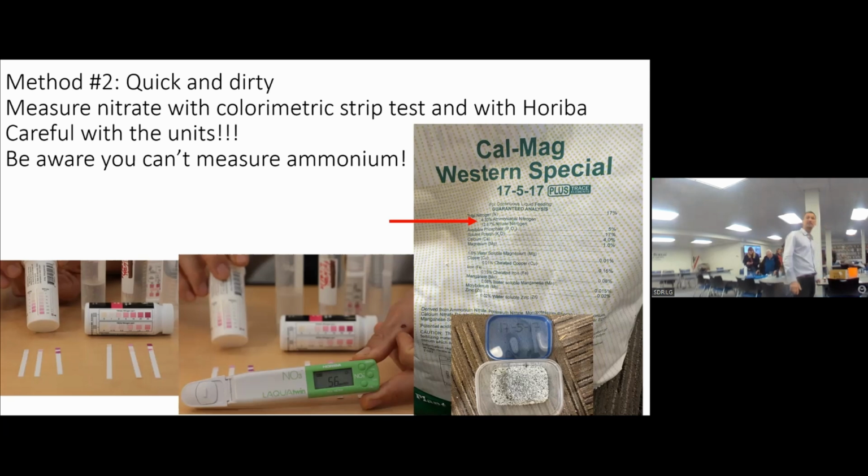The third method is a photometer. That is a machine. The third and the fourth methods are two photometers, and I hope you can see them, people are still playing with them. It is a machine that looks with an electronic eye at this sample of water that you put in a little bottle that they call a cuvette. The instrument shines some light through this sample and measures the light that comes from the other side. Through this method, it measures the color of this water.